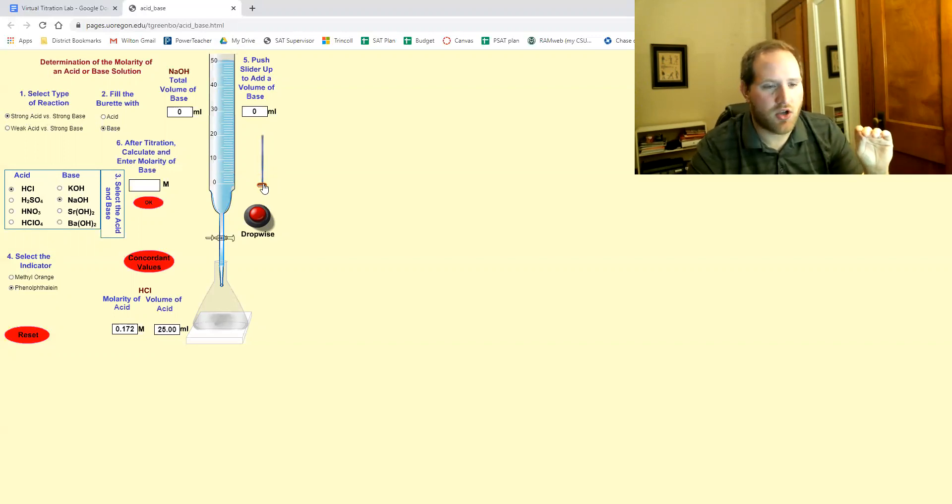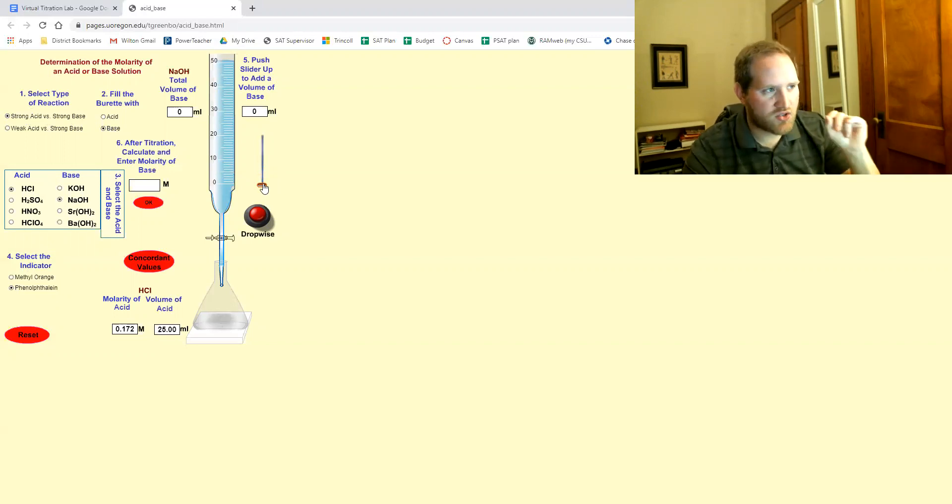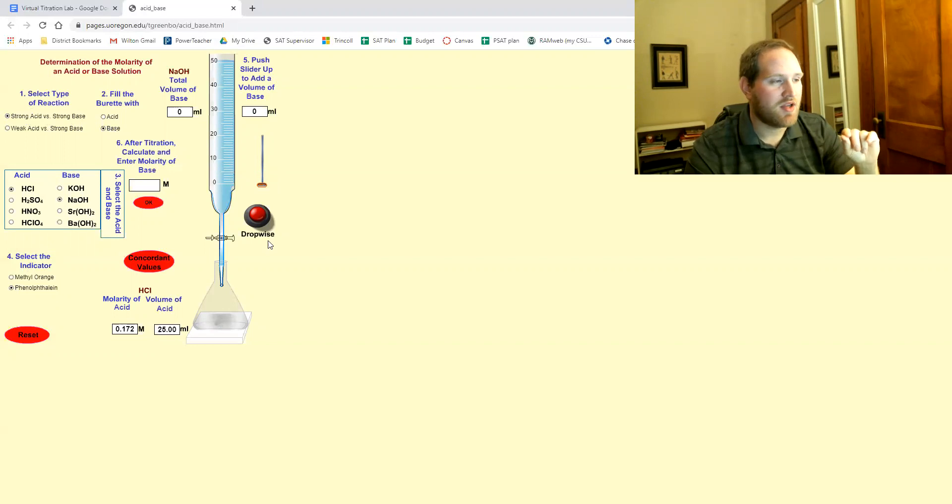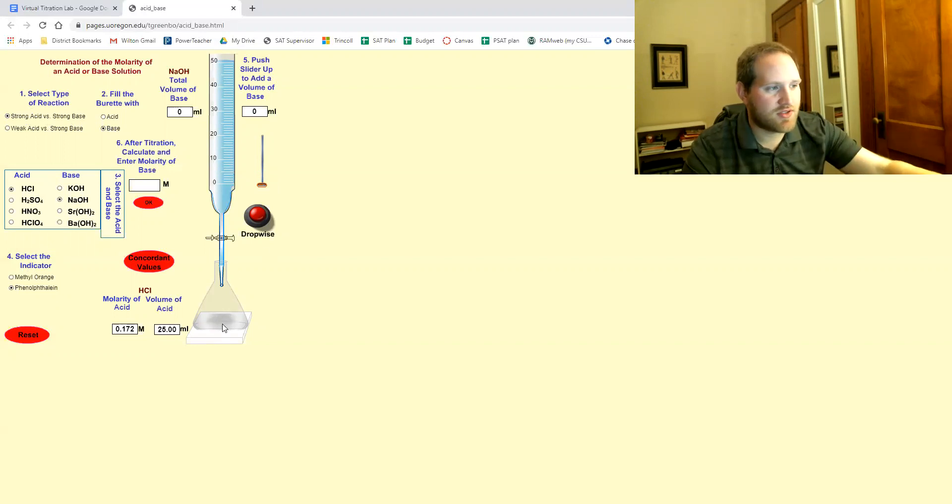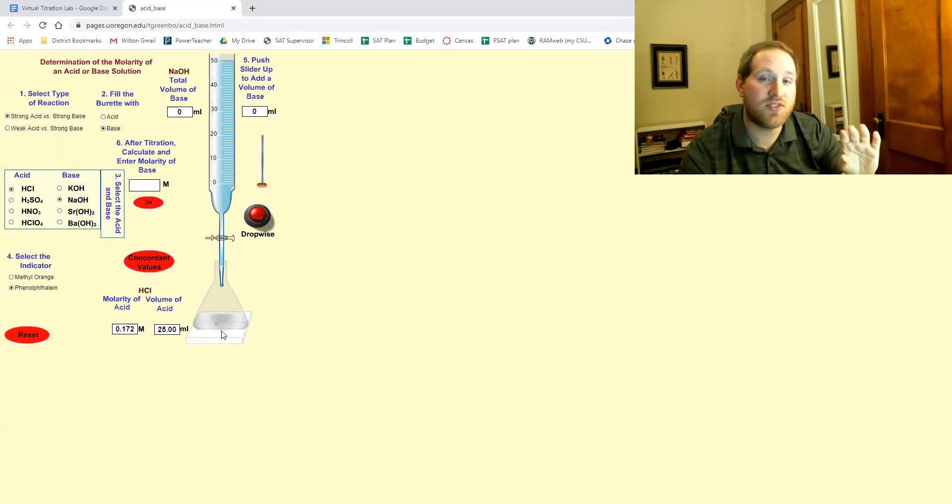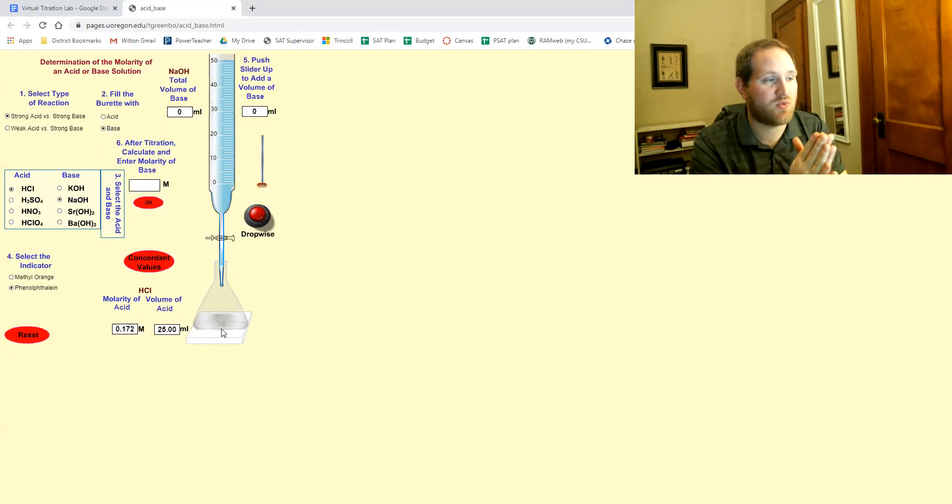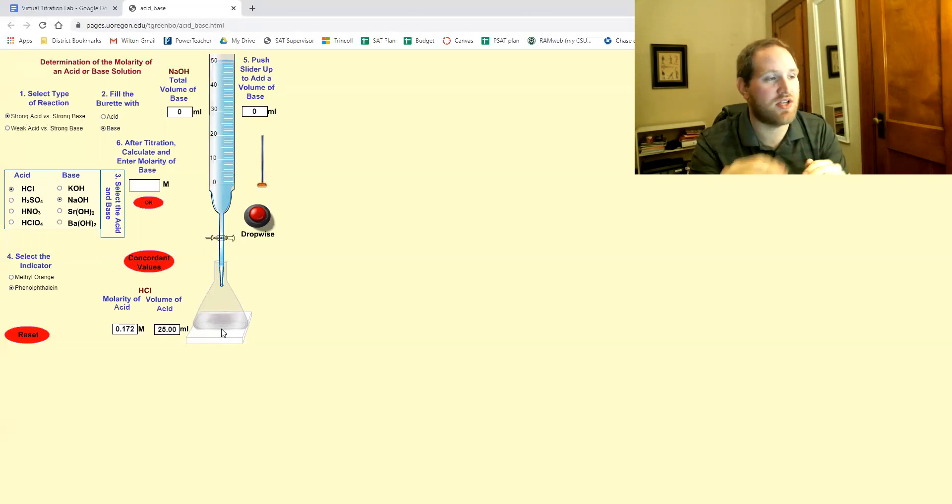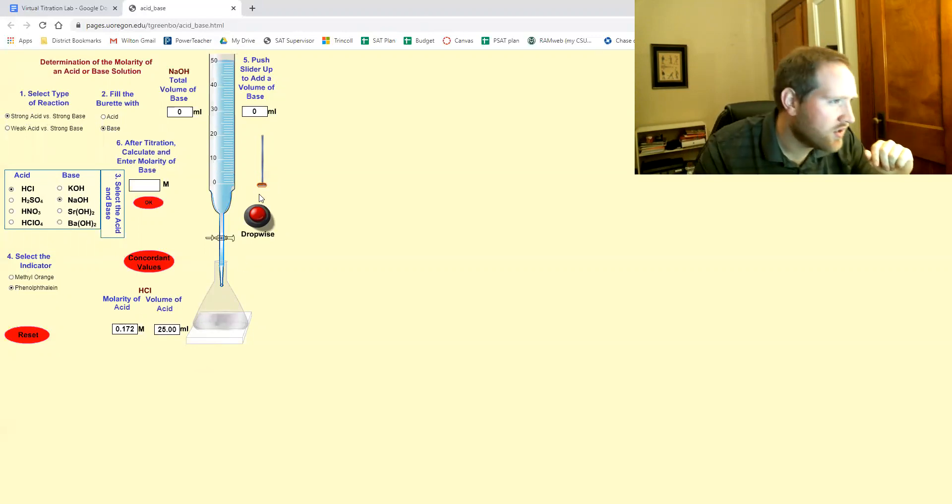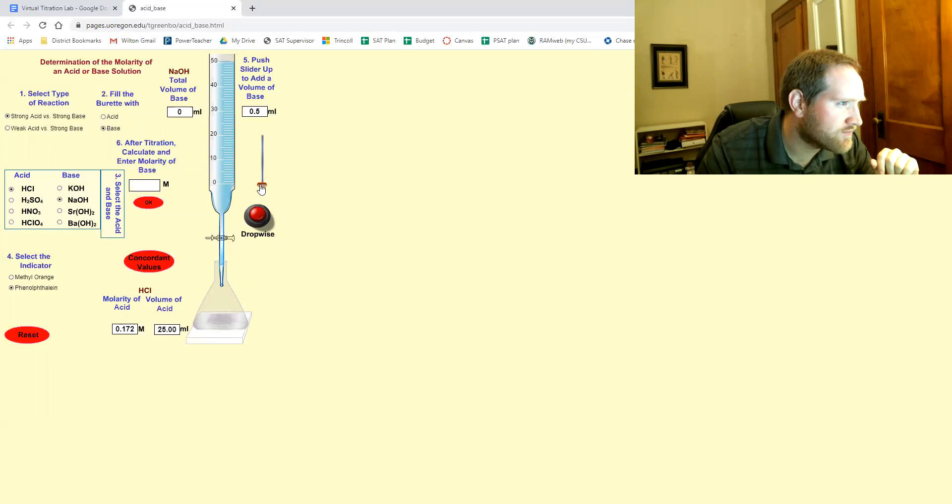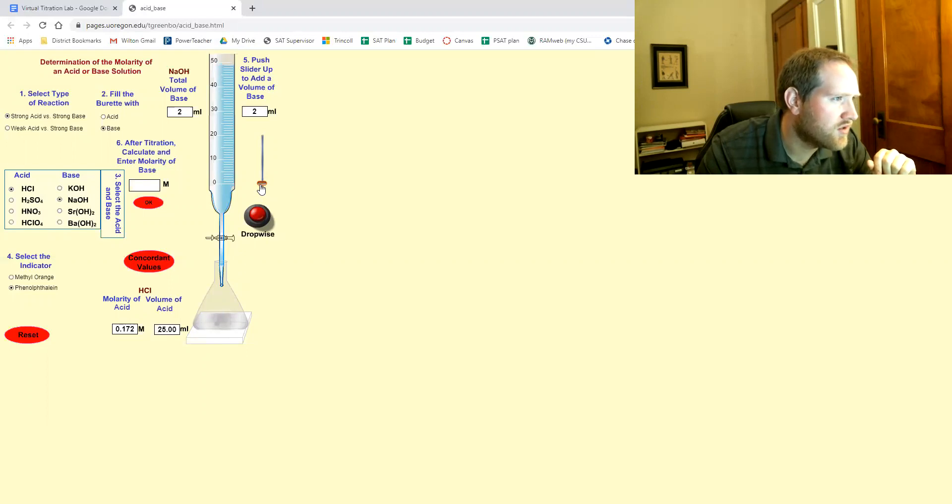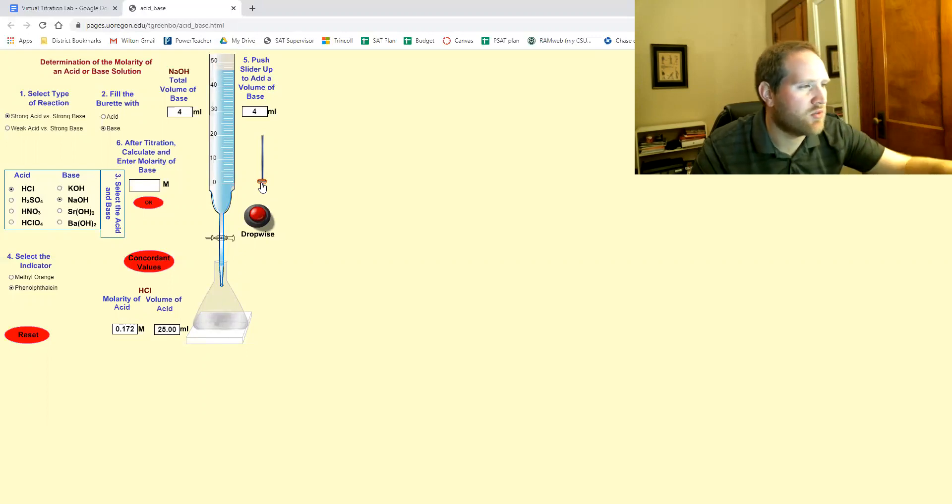So let me show you the right way to do it. We want to go in like one, two or three milliliter increments at a time, paying very close attention to the flask. And as soon as you see that flash of pink, that's when you stop adding big chunks and you switch to drop wise. All right. So here's two, about four.